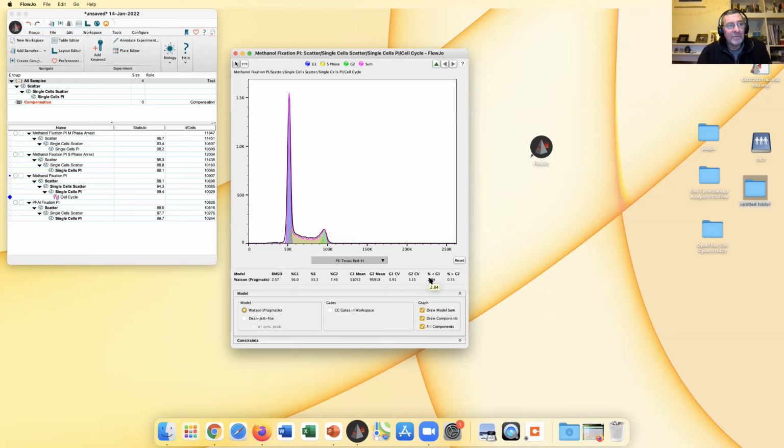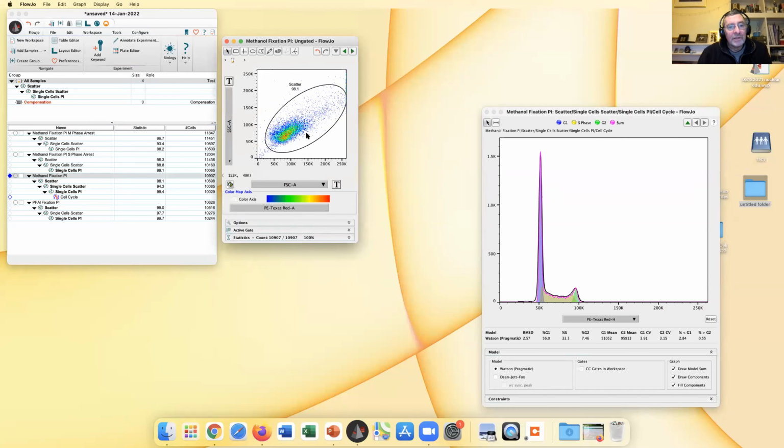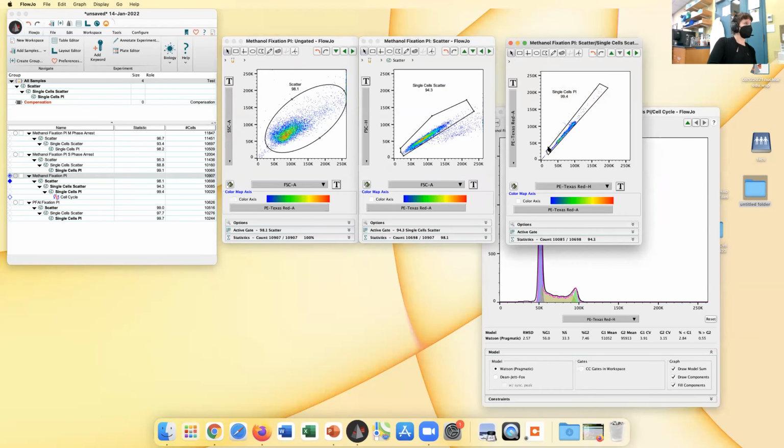Exactly. And when I'm looking for sub G1 populations, I would gate slightly differently than if I was looking for DNA. I would include most of the events that fall below the peak. Exactly, especially in that one. Yes, right there. Bring that down, and then you see that population changes. Right now it's 2.84. If you bring that up, you can. Oh, was there a real change? I guess not. So again, it does depend on the question that you're asking.